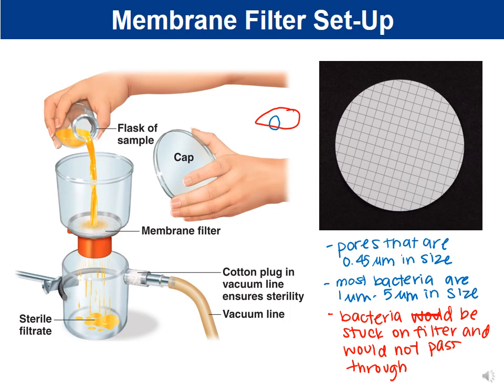So when I pour the water into the collection cup, again, the bacteria is going to get stuck on the filter, and what's going to pass through is not what we're testing.